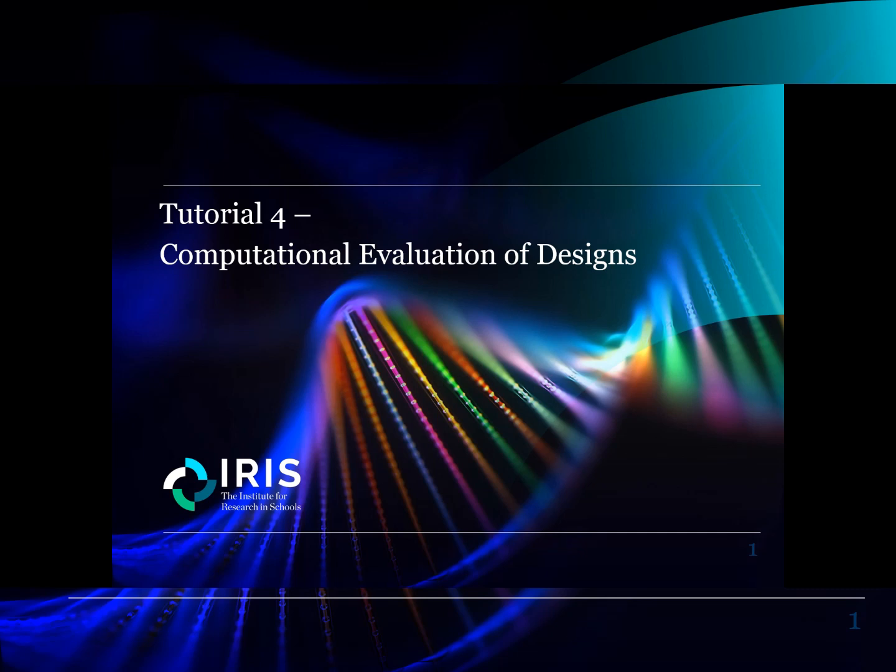By this stage in your project, you'll be able to make some simple designs and create and edit the files necessary to enable them to be structurally evaluated and analysed. As I mentioned in tutorial 3, the cost of each design is quite expensive, so it's important that before researchers buy the sequences required, they check whether their design is thermally stable.